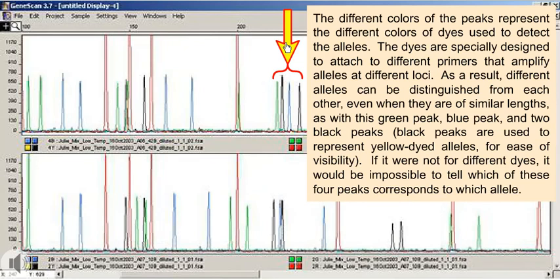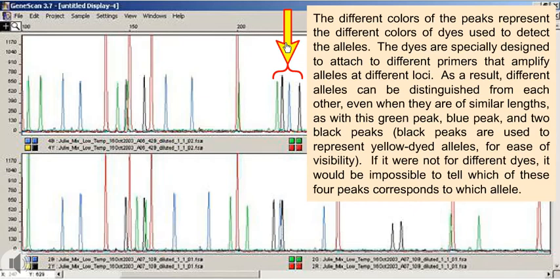The different colors of the peaks represent the different colors of dyes used to detect the alleles. The dyes are specially designed to attach to different primers that amplify alleles at different loci. As a result, different alleles can be distinguished from each other, even when they are of similar lengths, as with this green peak, blue peak, and two black peaks. Black peaks are used to represent yellow-dyed alleles for ease of visibility. If it were not for different dyes, it would be impossible to tell which of these four peaks corresponds to which allele.